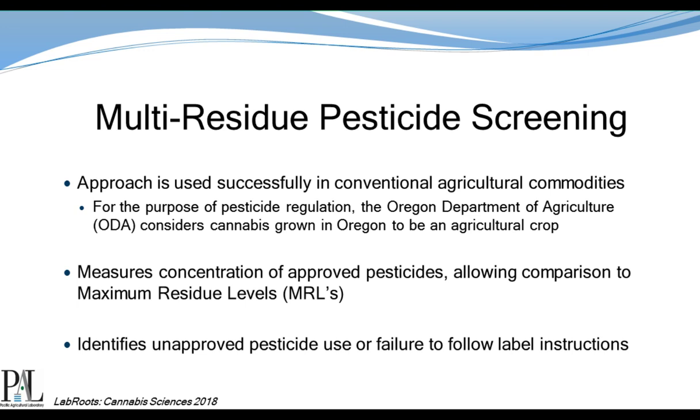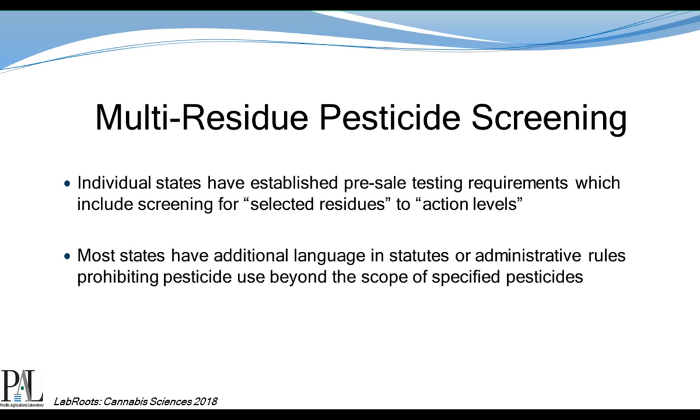A little note here: for the purposes of pesticide regulation, the Oregon Department of Agriculture considers cannabis grown in Oregon to be an agricultural crop. And that's what leads us into this multi-residue approach, as opposed to treating it completely separate.